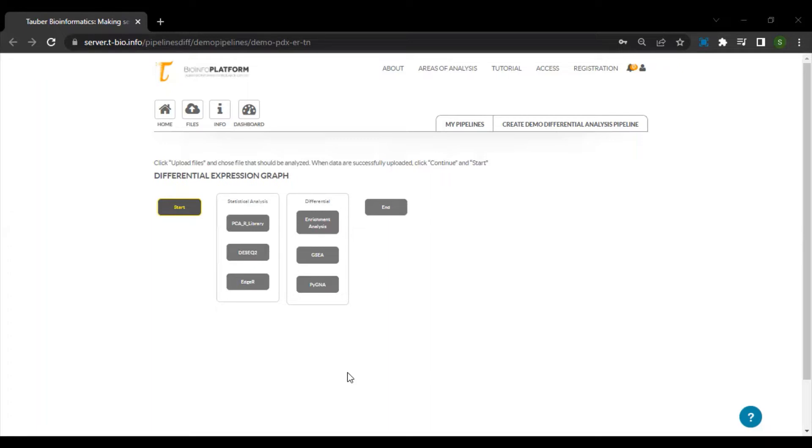Note that in this demo pipeline, we are making use of the gene expression table that was generated as an output from the RNA-seq pipeline.